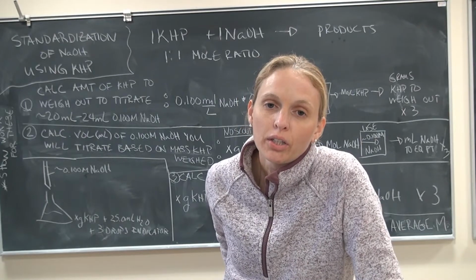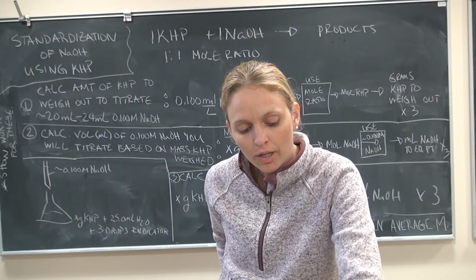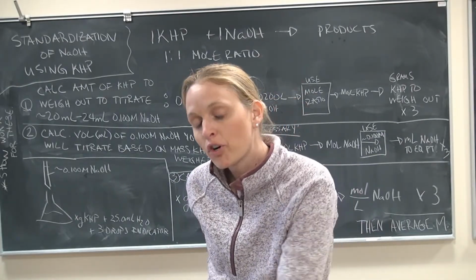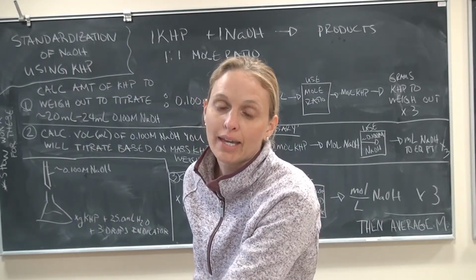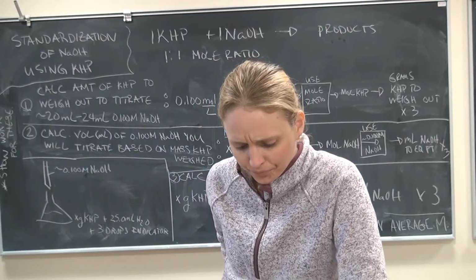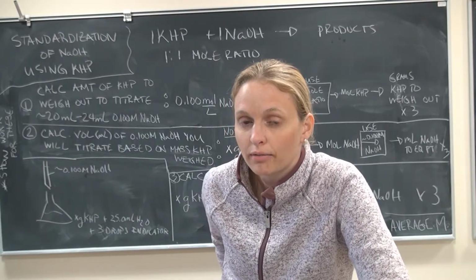So when we did those calculations, the sodium hydroxide molarity and the volume of sodium hydroxide that we titrated was then used to convert, using solution stoichiometry, to the moles of the acid, and then dividing it by the volume of the acid that we titrated to get the molarity of the acid. So initially, we're using the molarity of sodium hydroxide, right?